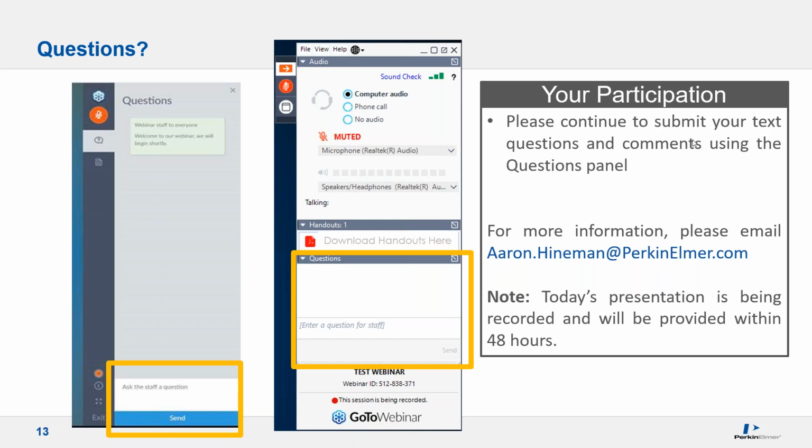Next question. Our lab is currently using WinLab software. Does this software also have IEC and MSF model building capability? Building models for IEC and MSF is more or less exactly the same in WinLab. You just get to the model builders a little differently. In Syngistix, they eliminated all drop-down menus, and instead we have ribbons across the top of the software. In WinLab, you'll find the model builders in the drop-down menus. Correct. But all the functionality is still there. The model builders are exactly the same. It's been around for many years now, actually.